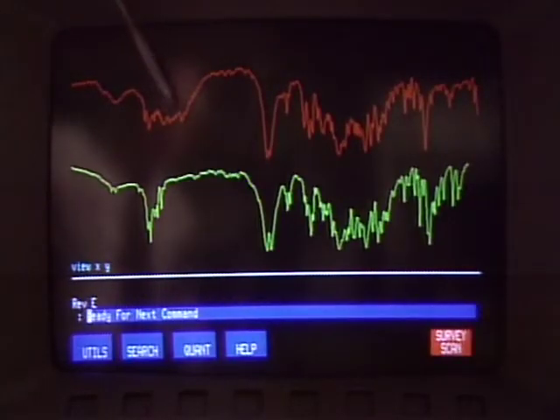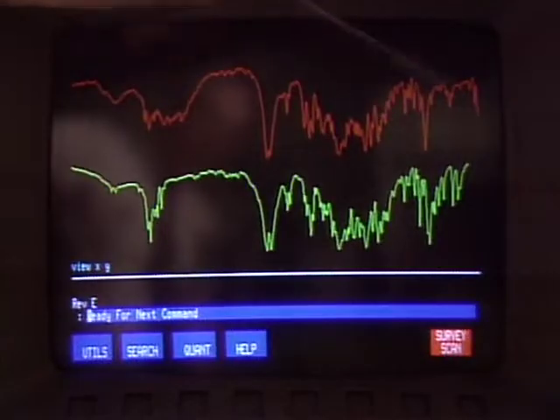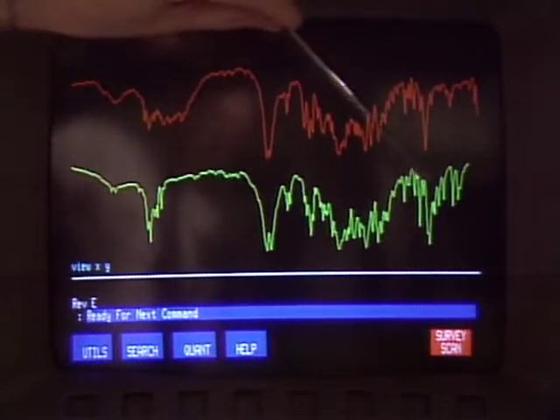Okay, now here you can see this is the hydrochloride. Now you can see the hydrochloride area right over here, which is absent in the cocaine-free base. And the rest of the molecule, more or less, is similar.